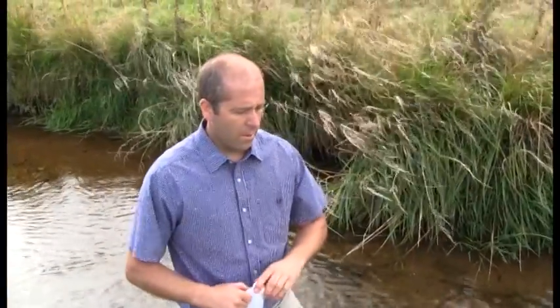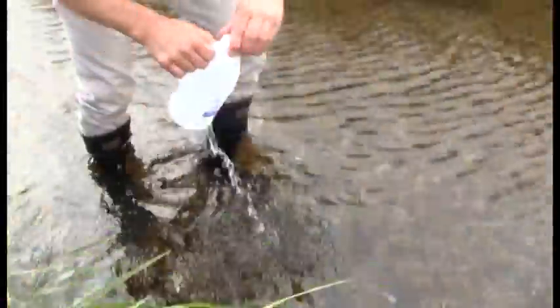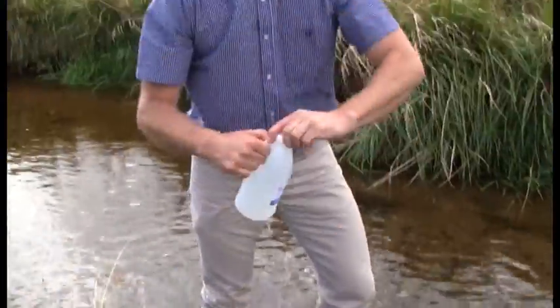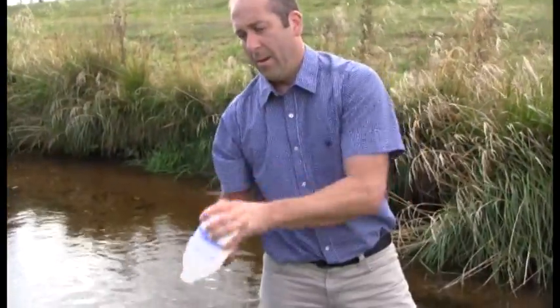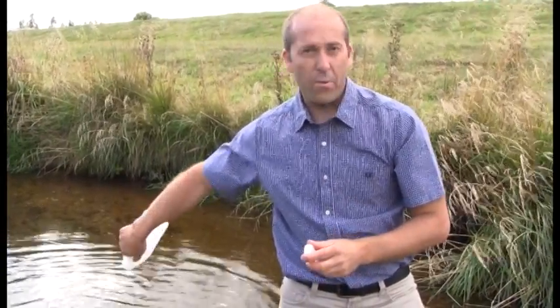When we take a sample, you want to plunge the bottle under the surface neck downwards and then tilt it so it faces upstream. Fill it at least halfway and rinse it three times. After each rinse, discard the contents downstream from the sampling point. After three rinses, take a final sample which will go to the laboratory.